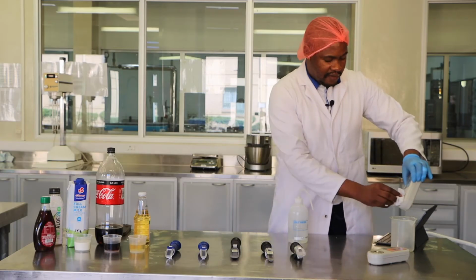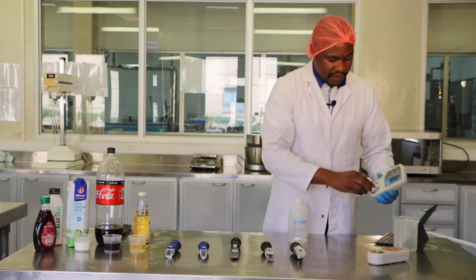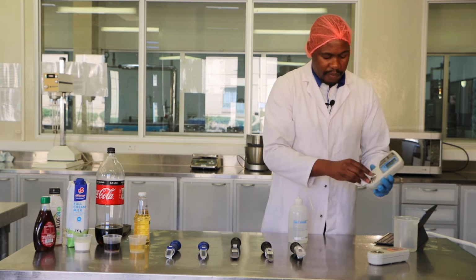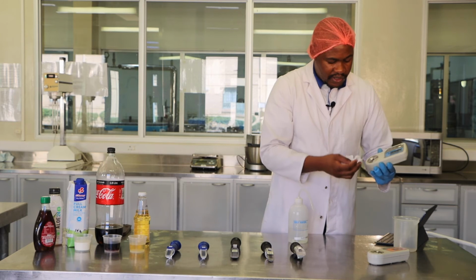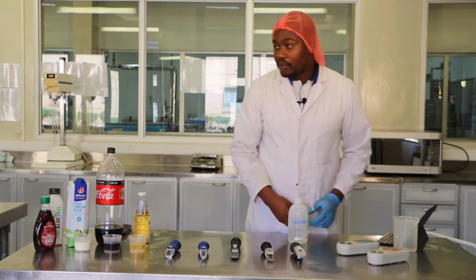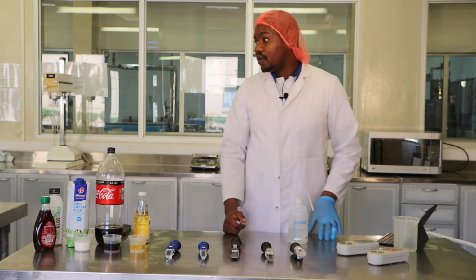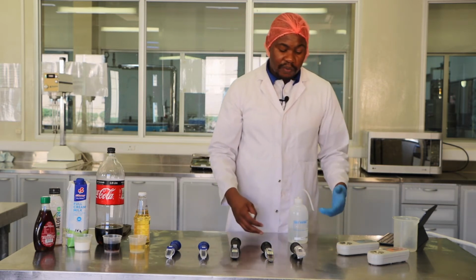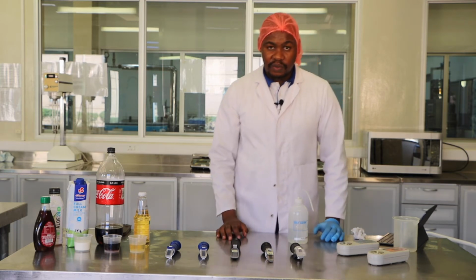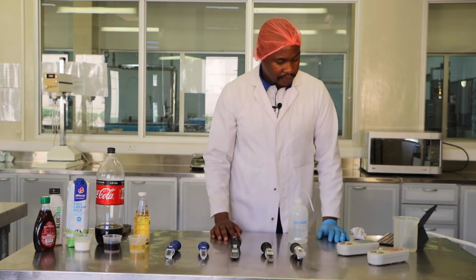So of course, every time you use your refractometer, it should be cleaned. Here we just use a paper towel to clean our refractometer. It's also important because you don't know what the previous sample was that was present in the refractometer, or who did the analysis. Maybe somebody did not clean the refractometer, so that is not a good practice, right?